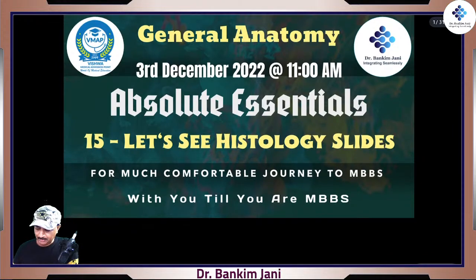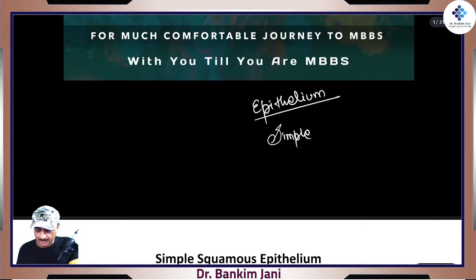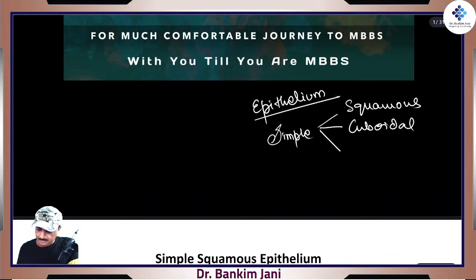So yesterday we talked about epithelium, right? And in that, we said that simple epithelium is something which will be having a single layer. And in that, there was simple squamous, simple cuboidal, and simple columnar.